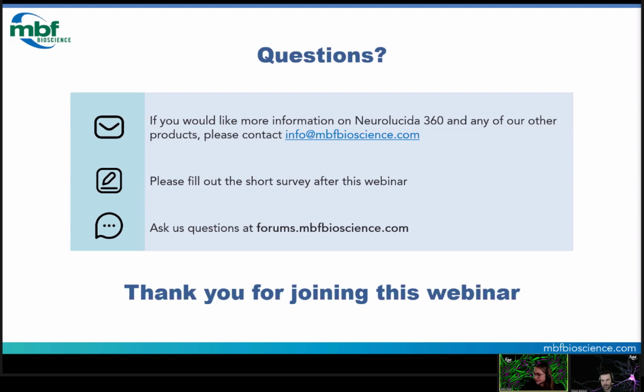I think that, unless anyone else has any questions here, I think we've answered all of them, and we are about 1 minute from when we said, oh, we had one more question come in.